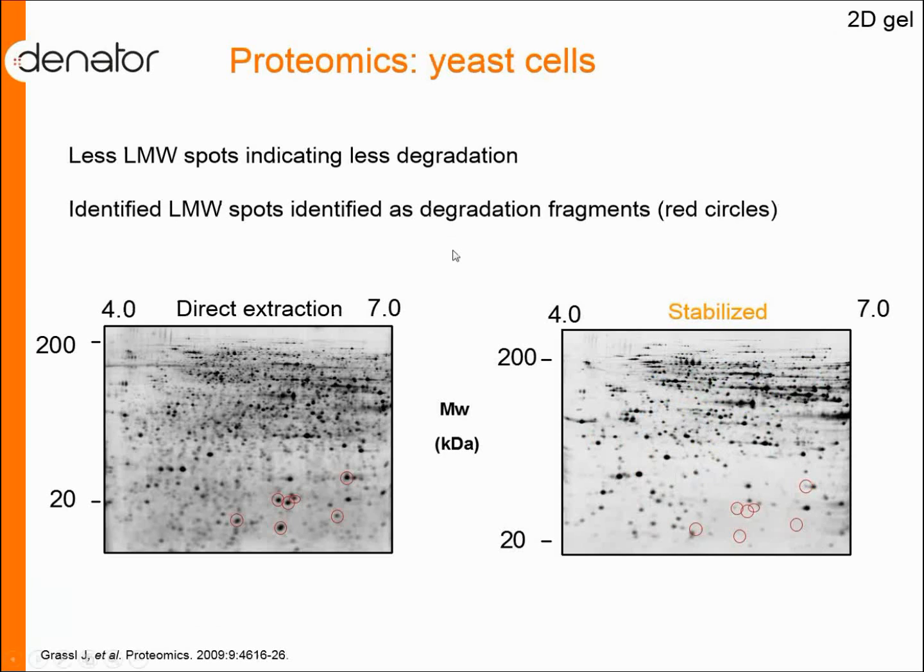The other sample is actually yeast cells. These are yeast cells in suspension which has been heat stabilized. We generally do solid tissue samples, but we're more and more getting interested in doing various sort of liquid samples, plasma, blood, in this case suspended cells and so on. And we think that the general principle of enzyme activity generally applies to all types of samples.